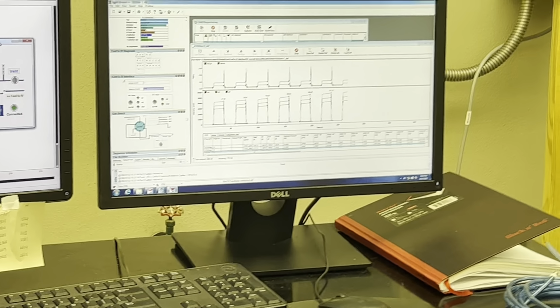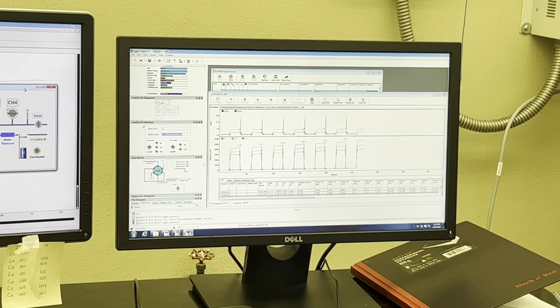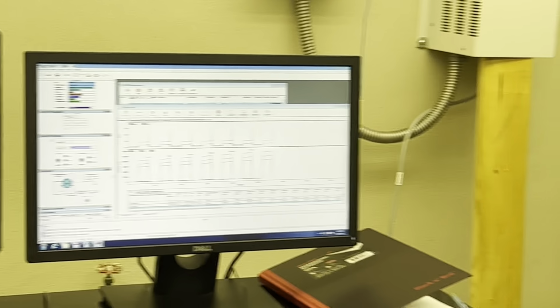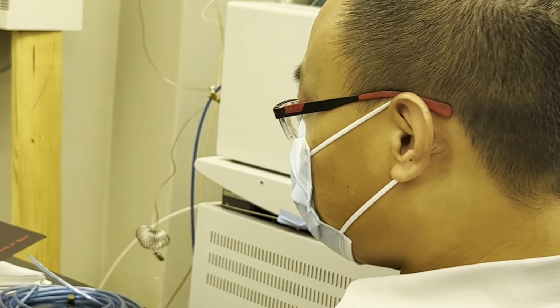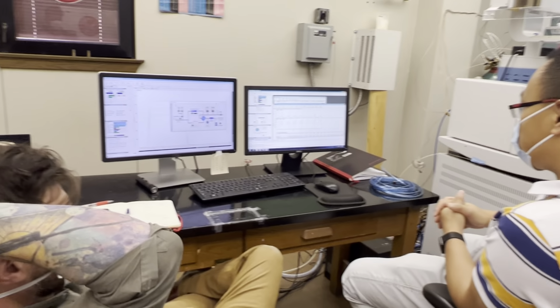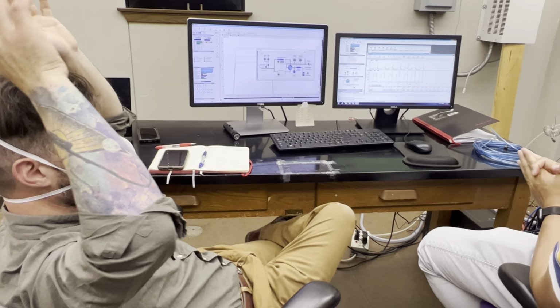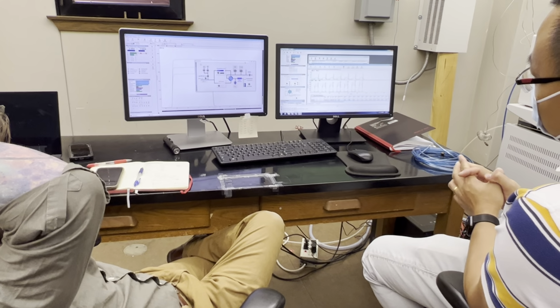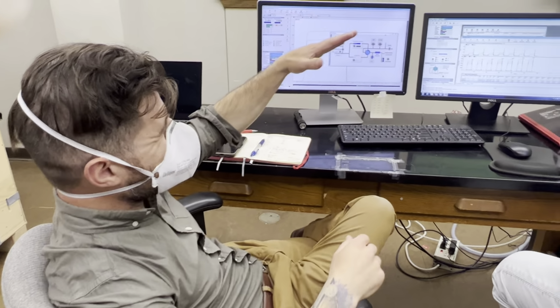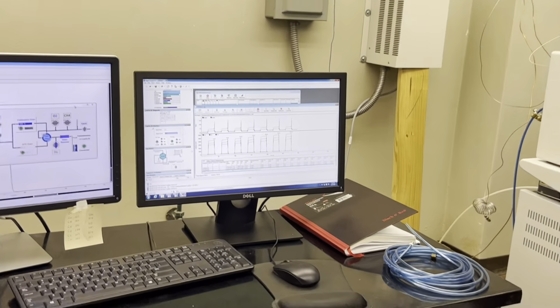I already do 10. Maybe for the normal analysis, I do 10 zeros, then linearity. If everything looks good, then I run samples. Yeah, so after you do the on-offs, aka zeros, aka zero enrichments, you do a linearity check. And that's where the intensity is going on. That's kind of a linearity.